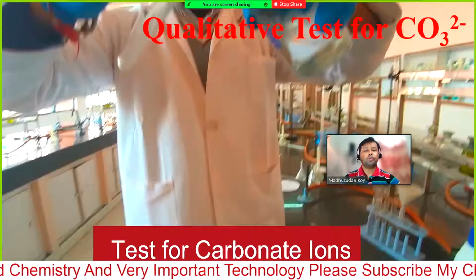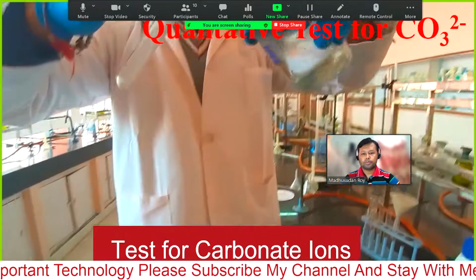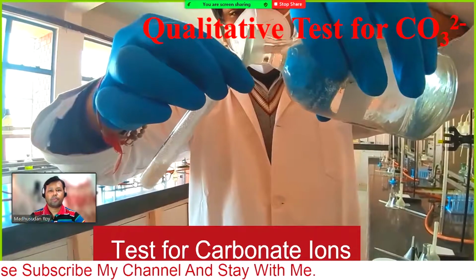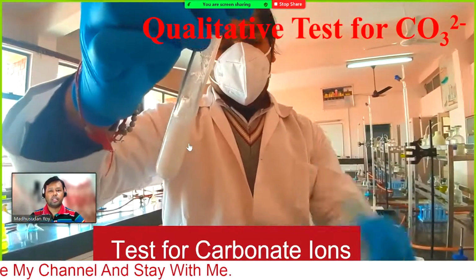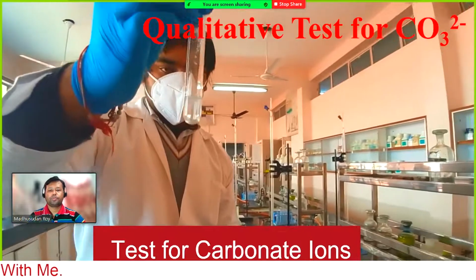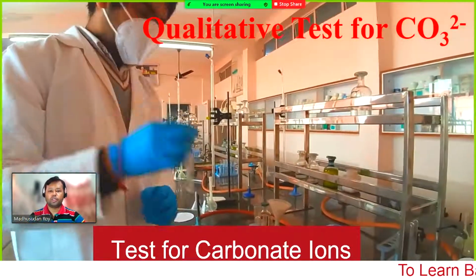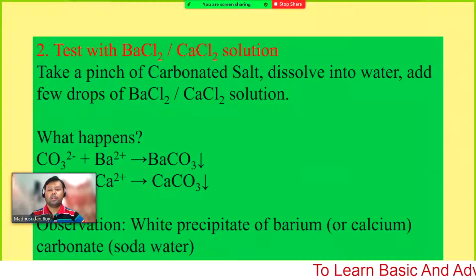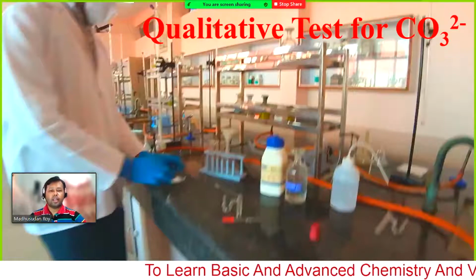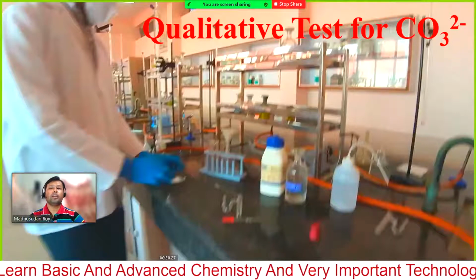So how can we prepare this? Let's see. Okay, this is the same thing we have shown. So this gives a clear solution. It has nothing to do, because it is just changing carbonate to carbon dioxide and water. So there is no precipitation, so it is giving a clear solution.